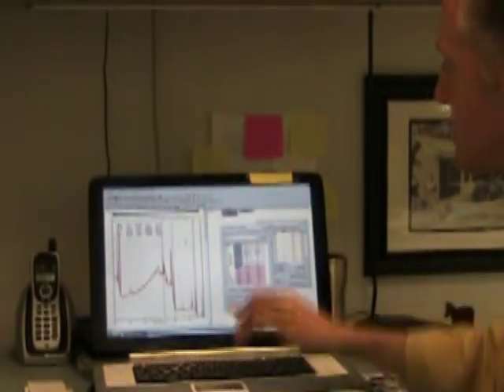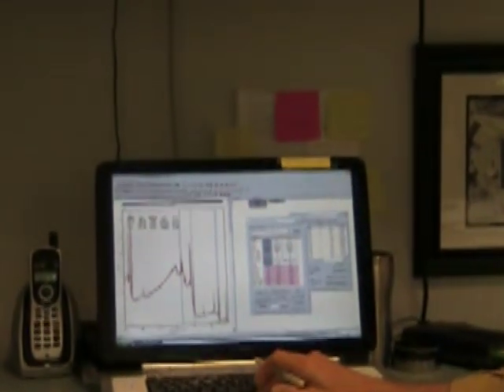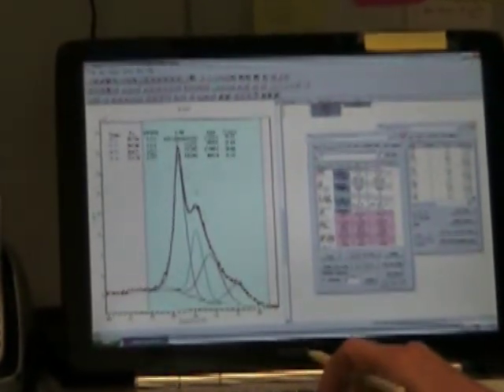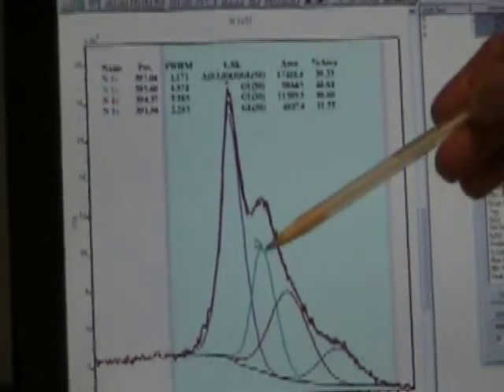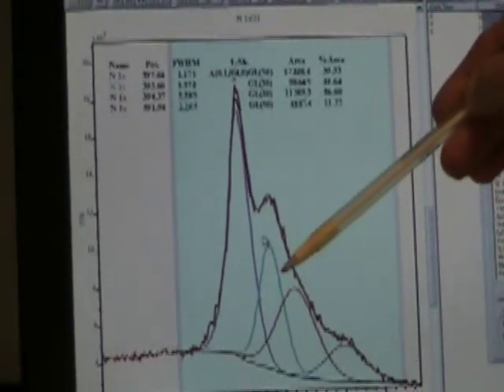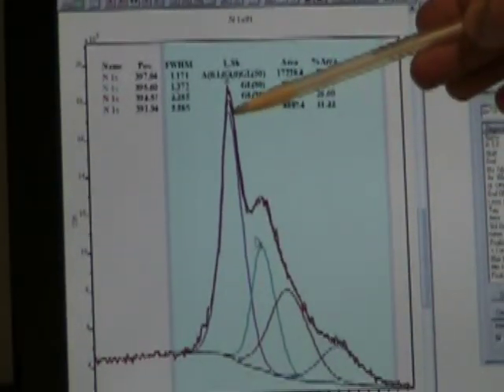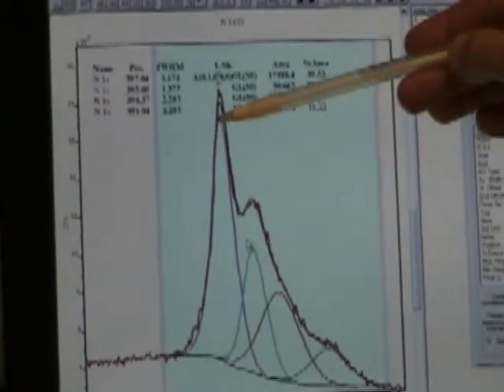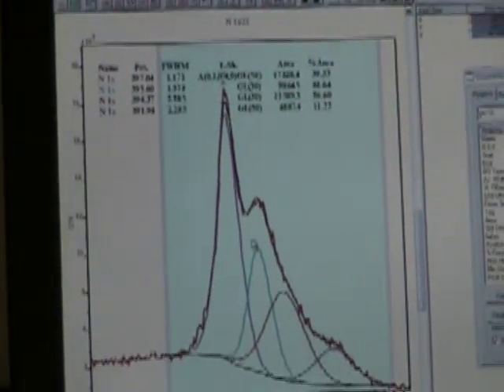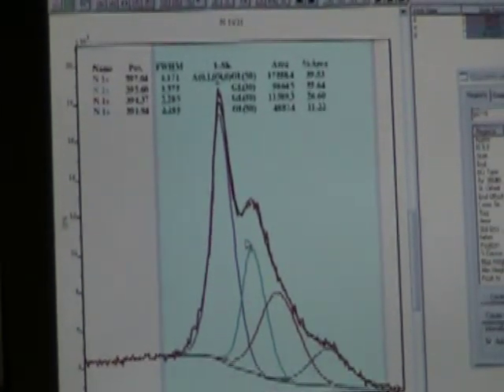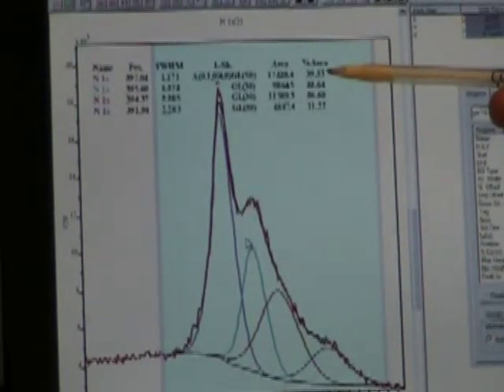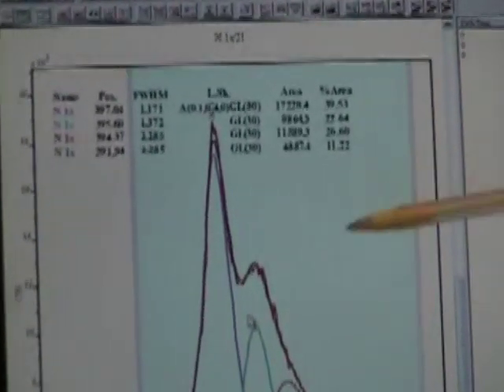Some of it is gallium Auger peaks that unavoidably become involved with that nitrogen in the low resolution scan. But if we go to a higher resolution scan on the nitrogen, we can see that here's that envelope that just shows up as one big peak in the survey scan. But at high resolution we can break it down into its components, three of which are gallium Auger peaks, and only one of which is actually nitrogen here at 397 eV binding energy, which is just perfect for nitrogen that's bound to a metal atom as it is in gallium nitride.